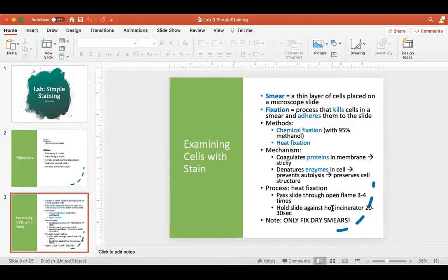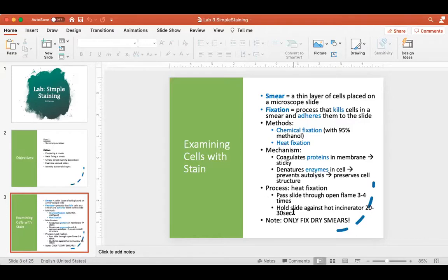The reason heat fixation takes a little practice is because you can do it for too short a time — that will allow cells to be washed off the slide when you apply stain — or you can heat fix for too long, which will simply burn up the cells. In either case, when you take your slide under the microscope the cells will be gone. So the key point is the timing of heat fixation.